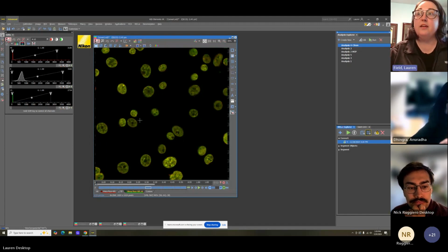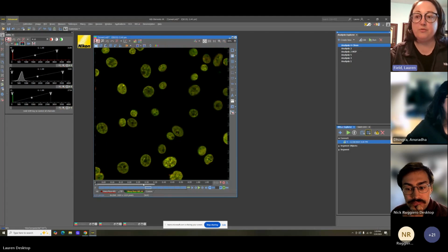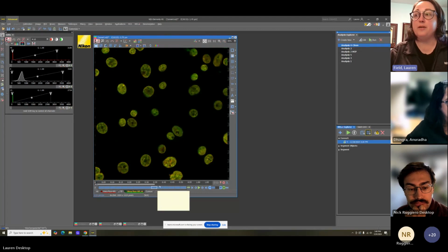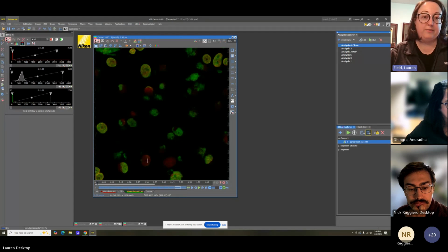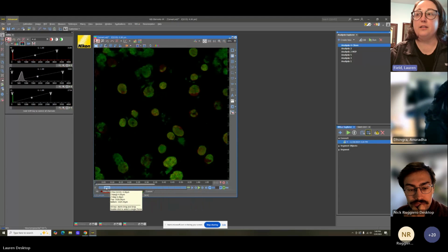When you're looking at this, you can see how accurate it is in trying to generate that DAPI image from just the transmitted file that we gave it. One thing to keep in mind is I gave this a center image and I didn't train it on a ton. So we have some areas up near the top of the stack where it's created the green from something that it thinks it saw in the transmitted channel. So if you truly wanted this, you would have to run it on every single layer in the stack.